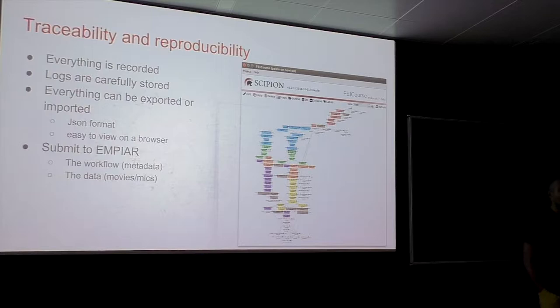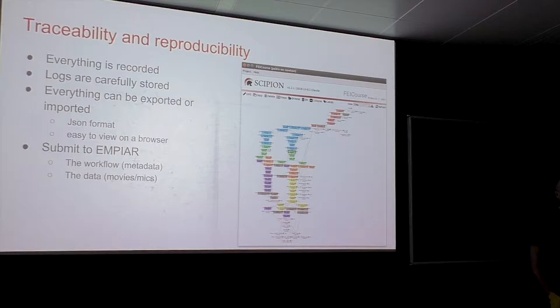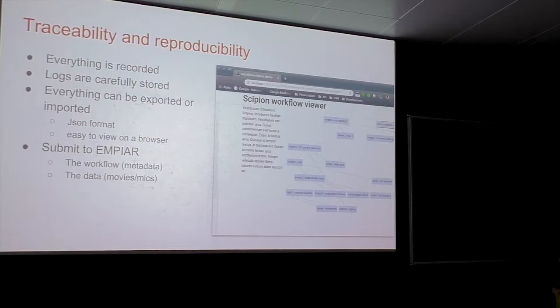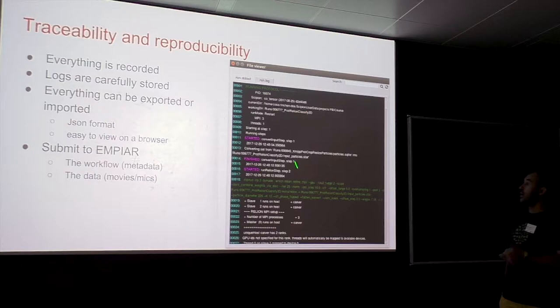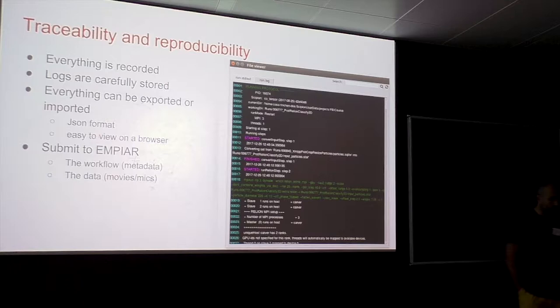Everything is recorded and all logs and outputs for each method are carefully kept. You can click on any box and see the log output of Relion or whatever method is involved. That workflow can be exported or imported — with one click you export a JSON format text file, which is human-readable but also easy to read programmatically and viewable in a browser.